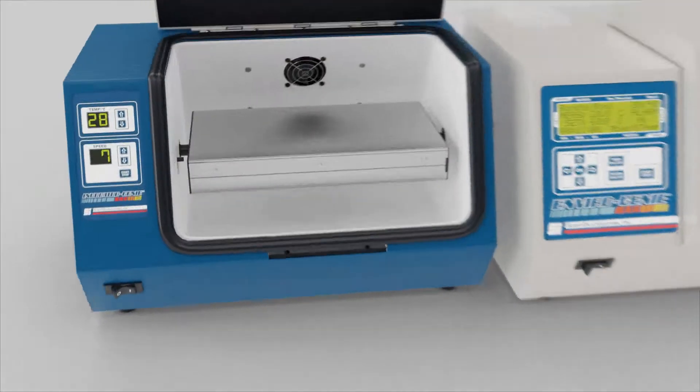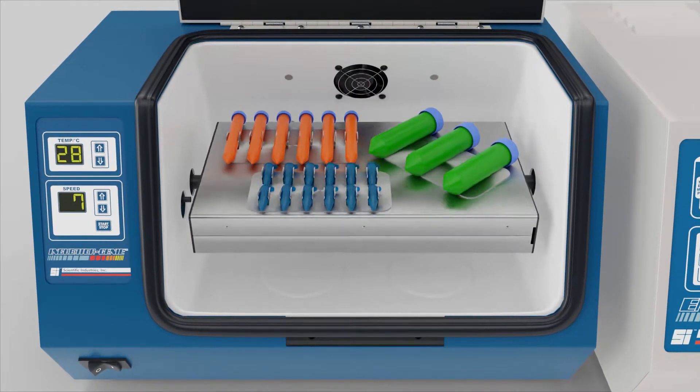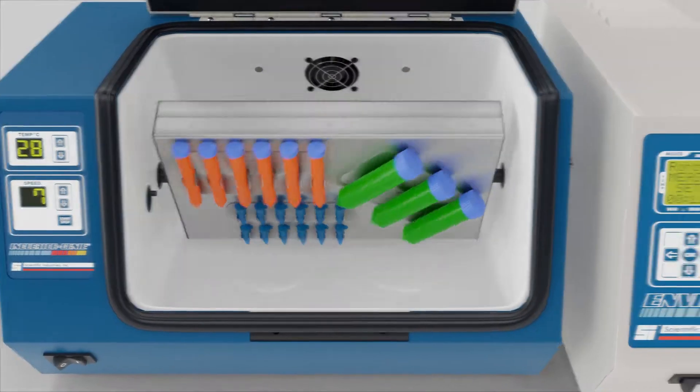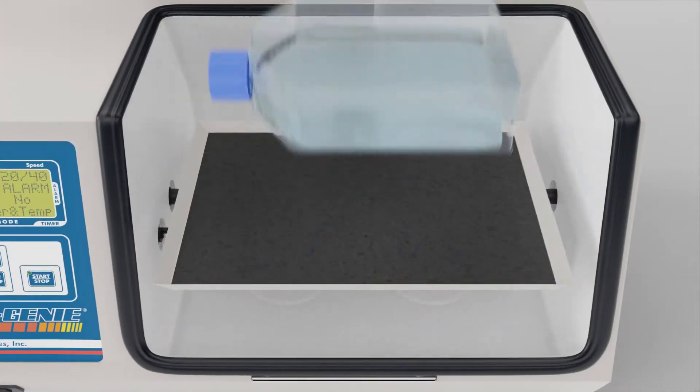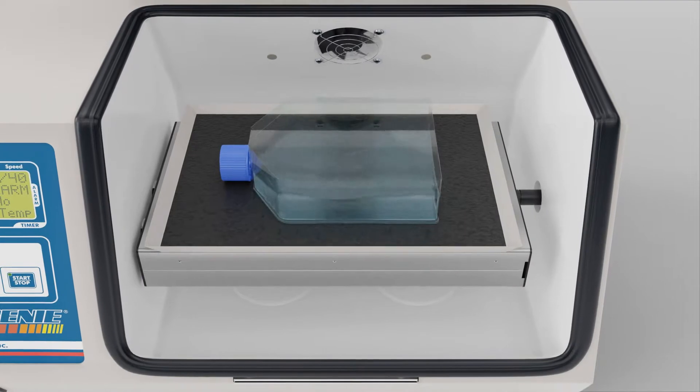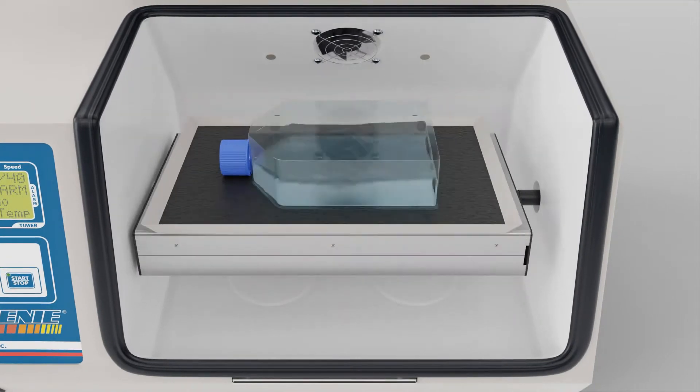Supplied with an assortment of attachments for out of the box setup and easily adaptable to a variety of additional accessories.